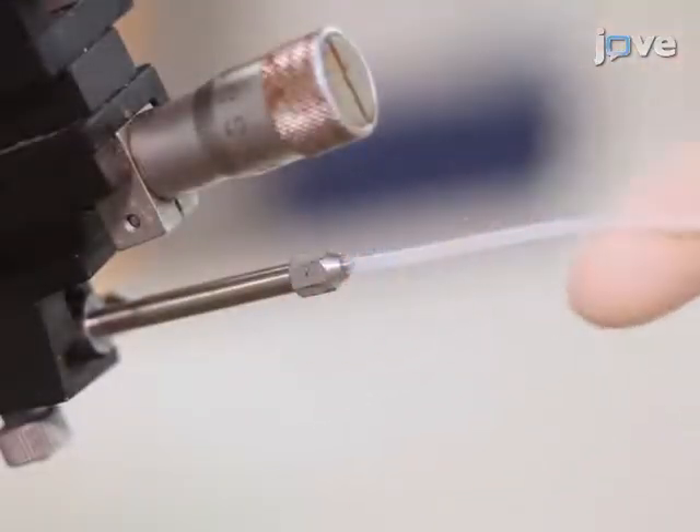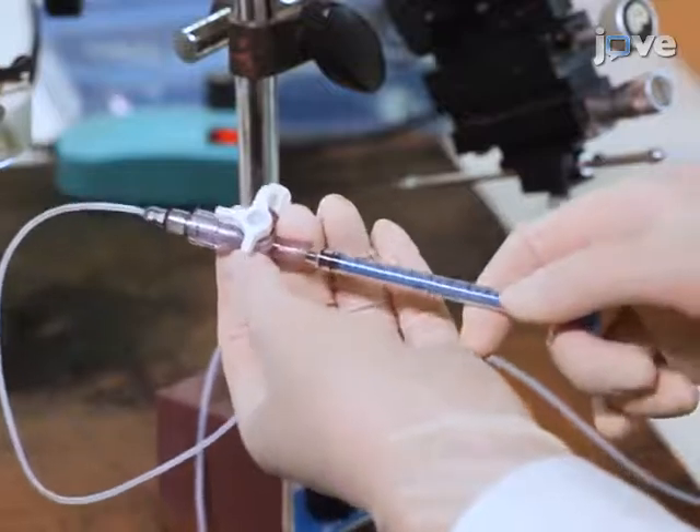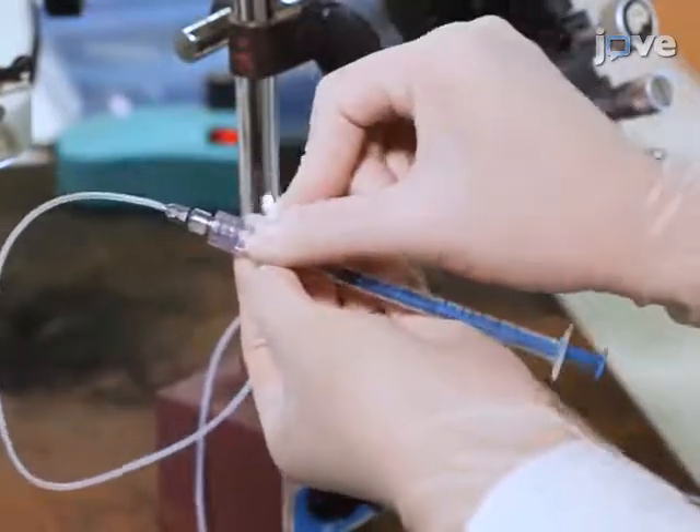Then attach a thin tube and a syringe to the other end of the capillary holder. Connect the thin tube and the syringe with the three-way valve and shift the three-way valve to open.